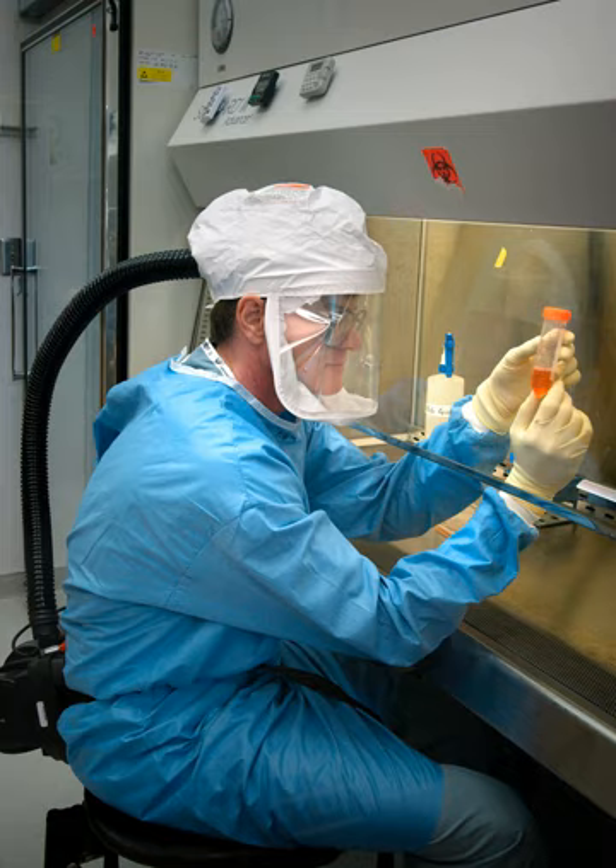Class I cabinets provide personnel and environmental protection but no product protection. In fact, the inward flow of air can contribute to contamination of samples. Inward airflow is maintained at a minimum velocity of 75 feet per minute. These BSCs are commonly used to enclose specific equipment or procedures, e.g. aerating cultures that potentially generate aerosols. BSCs of this class are either ducted, connected to the building exhaust system, or unducted, recirculating filtered exhaust back into the laboratory.